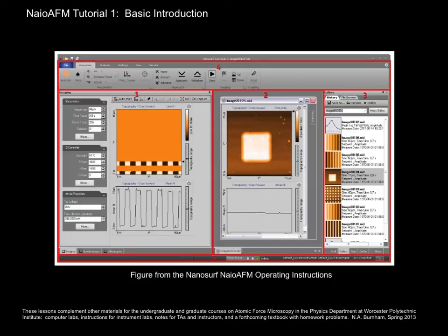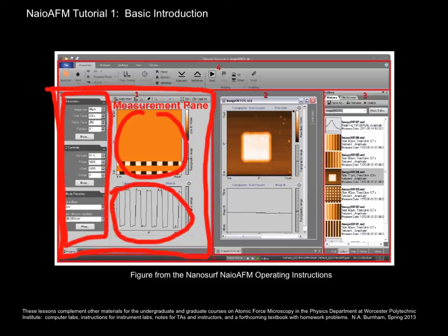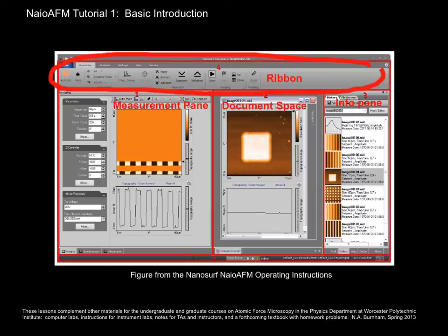Here's the user interface of the software. There are five main sections to it. The measurement pane is where you'll watch your data coming in, your images forming, the cross section of your images, and the imaging parameters. The document space is where you can call up saved data and work with them — observe and analyze them while collecting other measurements. In the info pane, you'll be able to look at your images in the gallery, ask for help, and view videos by means of tabs at the bottom. This ribbon functions much like a ribbon of a word processing system — that's where most of the controls are. Finally, we have the status bar that tells you what's going on with the instrument.